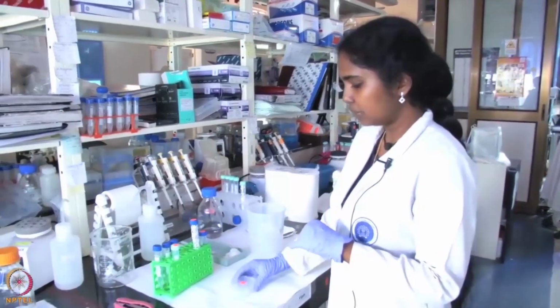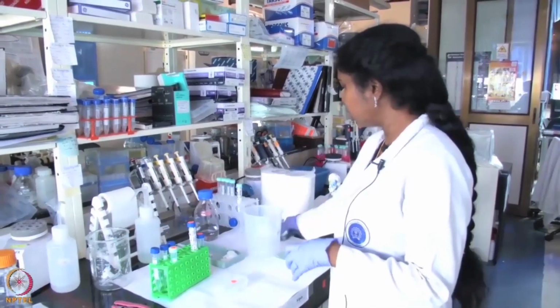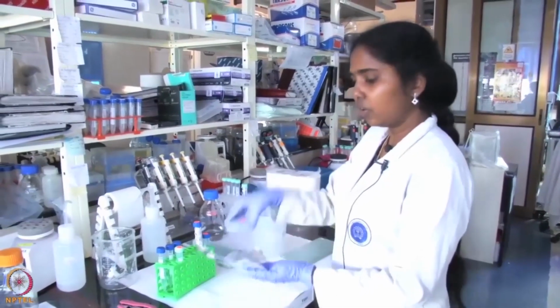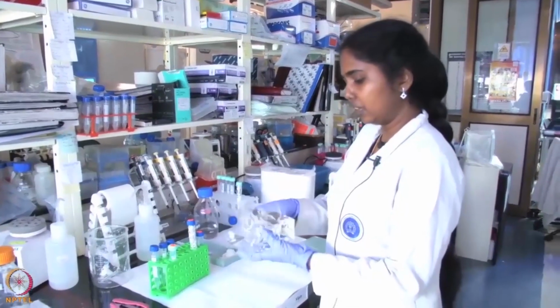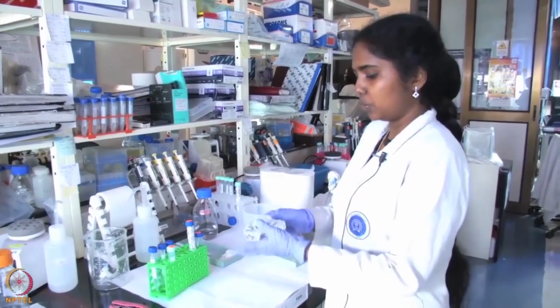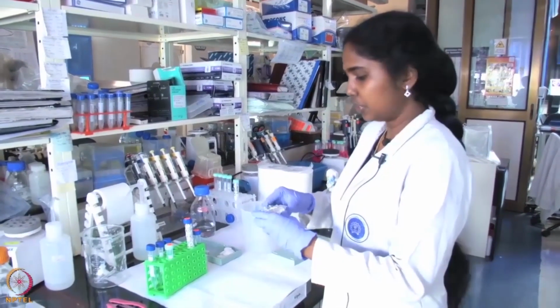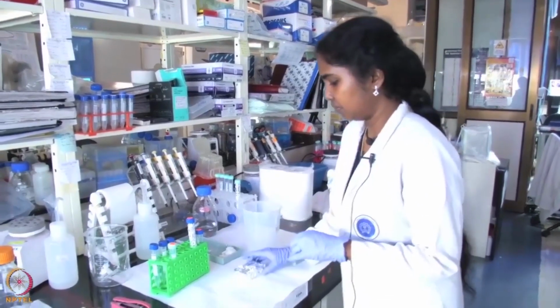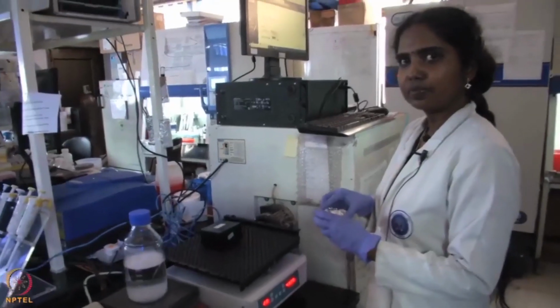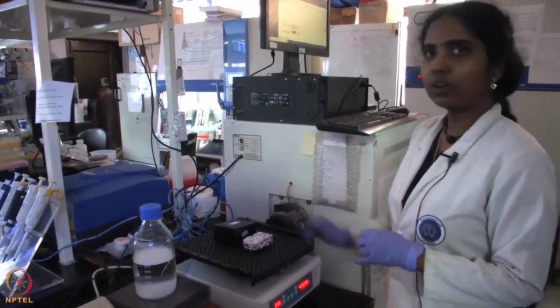So once you have added the solution, that is the antibody solution, you have to cover the box with foil or any other dark cover, or you can use a dark box also. Now we will keep it for 2-hour incubation. So I am keeping the secondary antibody for 2-hour incubation.